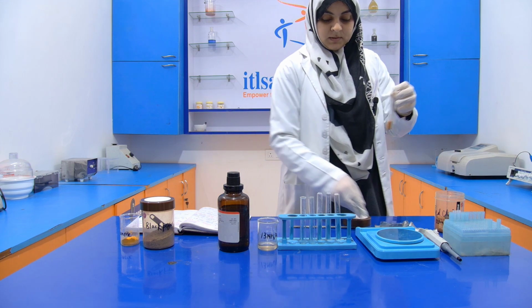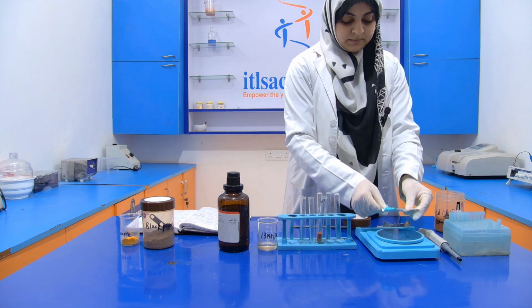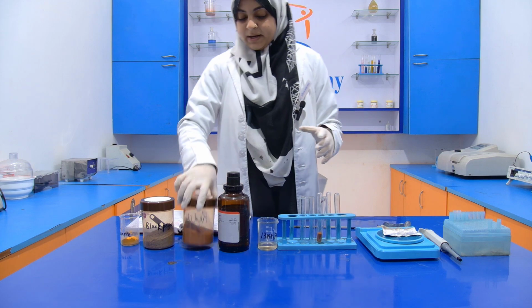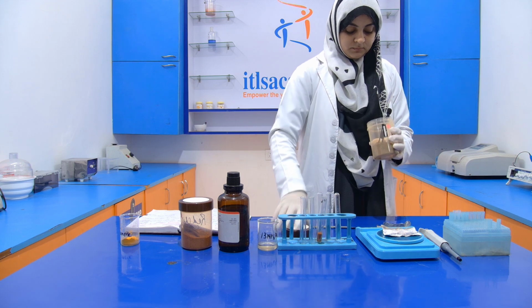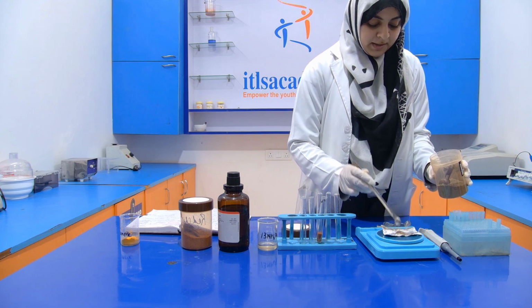Now put this test tube aside. Take the second. Now take black pepper. Again we require 1 gram.